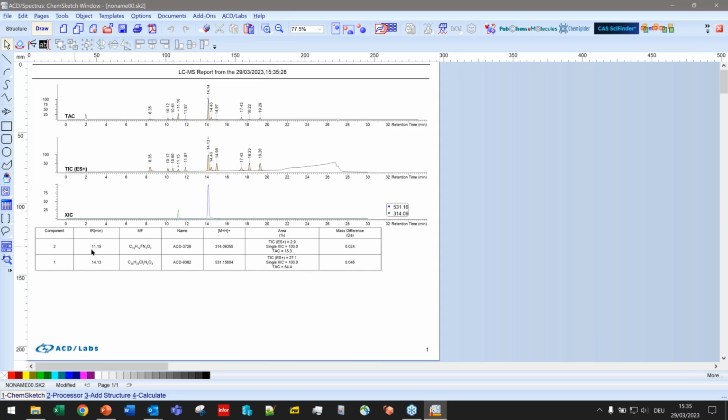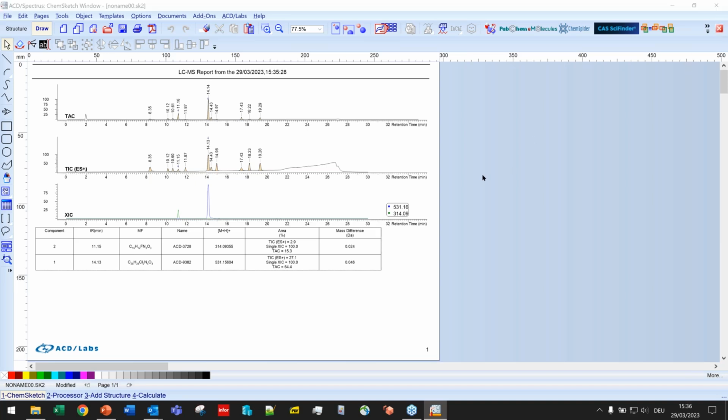So you can see that the table of components is now looking a bit slim. It doesn't have the structure anymore. It doesn't have the record. And if I wanted to, there's still some space. As I said, I can also go back to adjust the column width, another possibility. All right, but overall, I'm quite happy with how it looks now. So I will continue working on the individual components. So let me close the report and generate the second page of my reporting template.